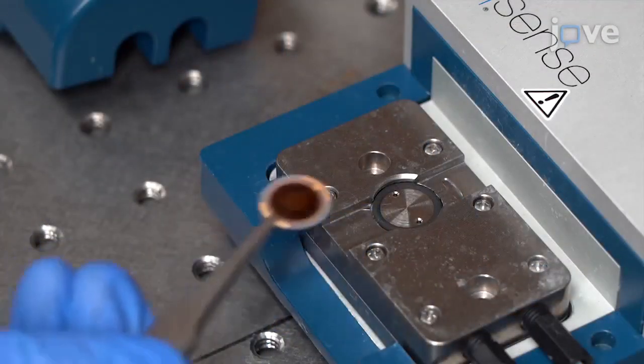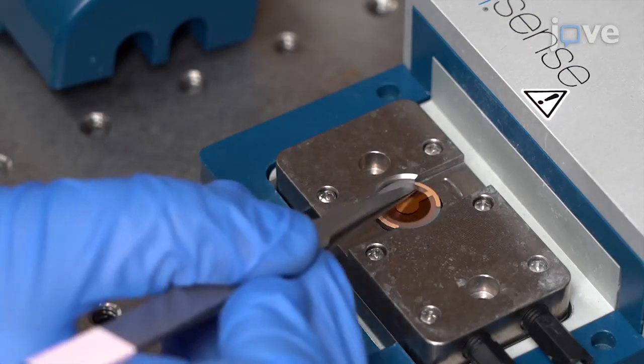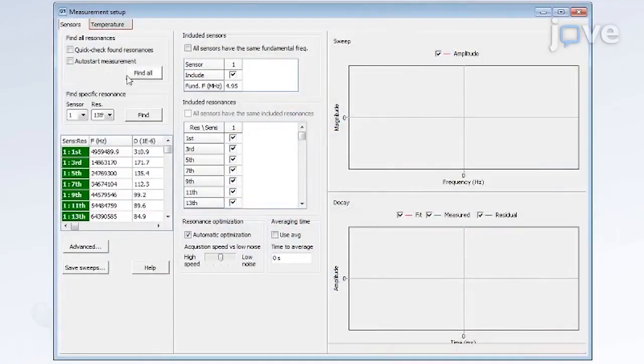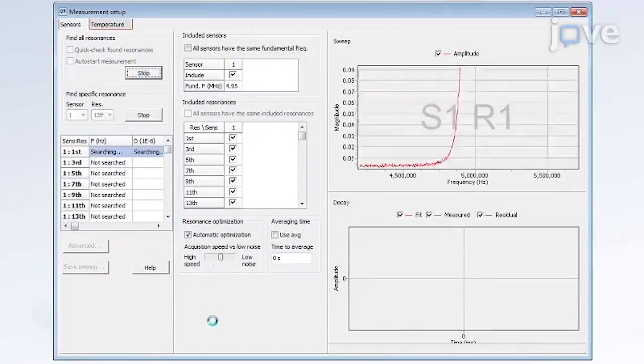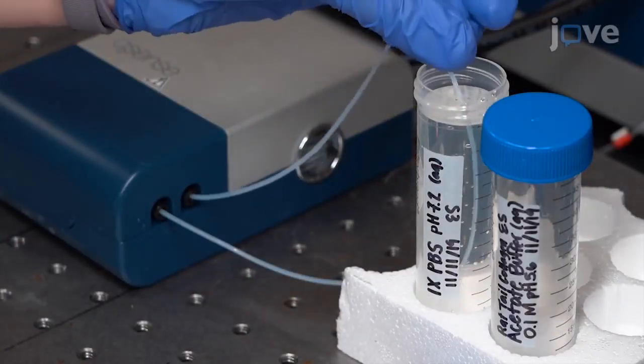Mount the sensor on the O-ring by placing the sensor with the active surface side down and anchor-shaped electrode oriented toward the marker in the flow module. Find the initial resonance frequencies of the sensor. Place the inlet pump tubing in the 1x PBS.